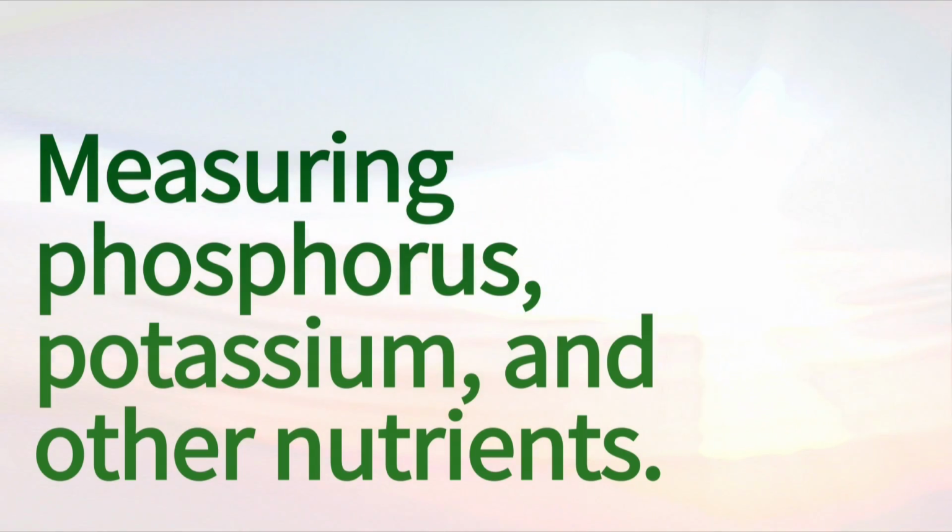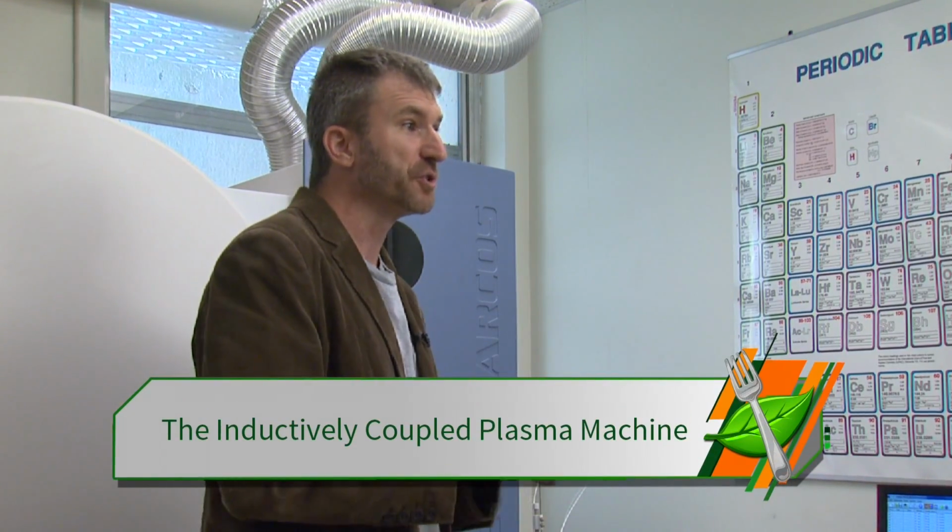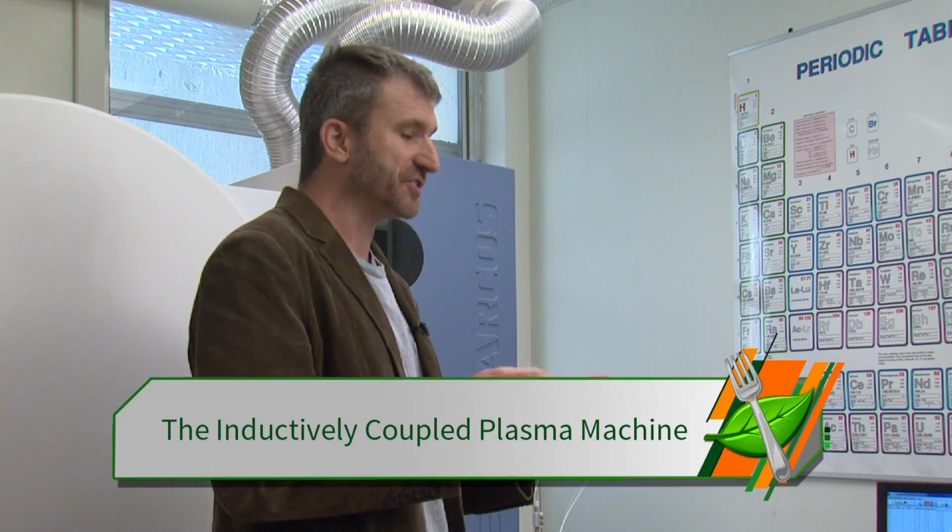In addition to measuring the nitrogen content of the soil, most farmers are always going to want to know the phosphorus content, the potassium content, and they may want to know other things like the copper and boron content of the soil. To measure those nutrients other than nitrogen, they use what they call an inductively coupled plasma machine. I think this is the coolest part of the soil test lab. The technology is just mind-boggling. And it works like this.